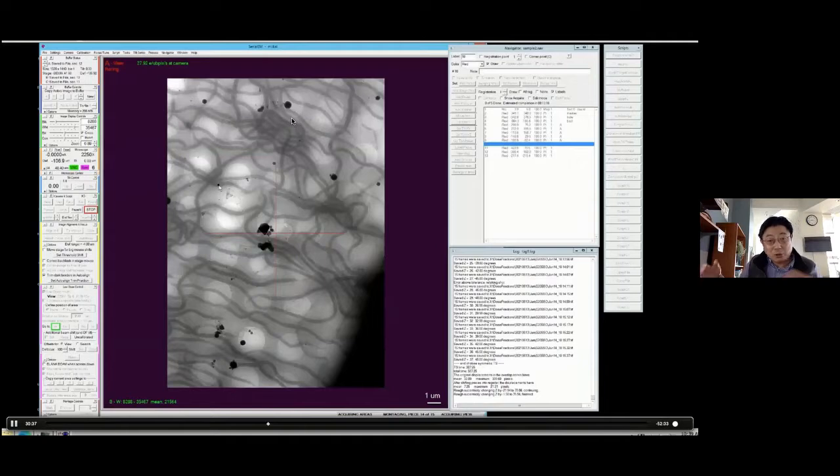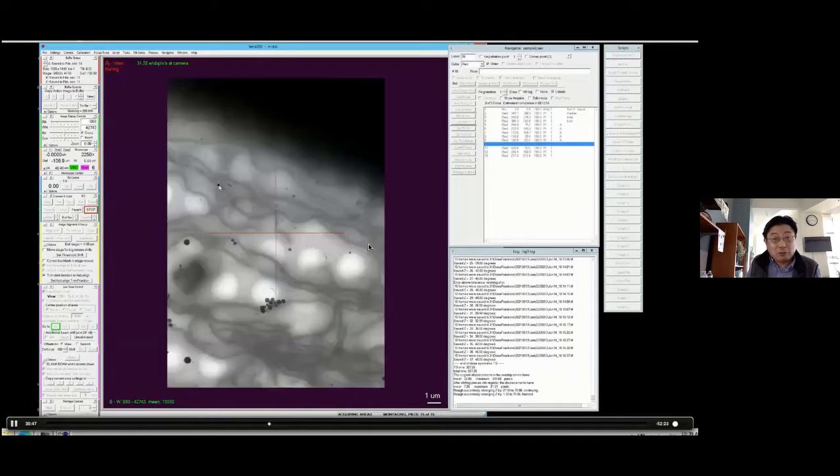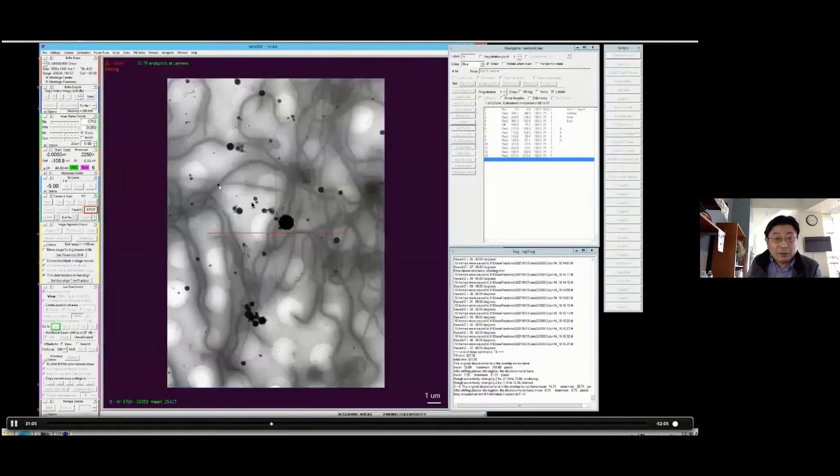So when you stitch together 5 by 3 pictures, you want to make sure they stitch together properly. If they are not stitched properly, you will see it. Like this one, you can see they put together very nicely. You can see 5 by 3 put together, and this is a grid bar, and you get a nice overview. And then this software will automatically go to the next one to do this. So this could keep going for another 5 to 10 minutes. So any questions so far?